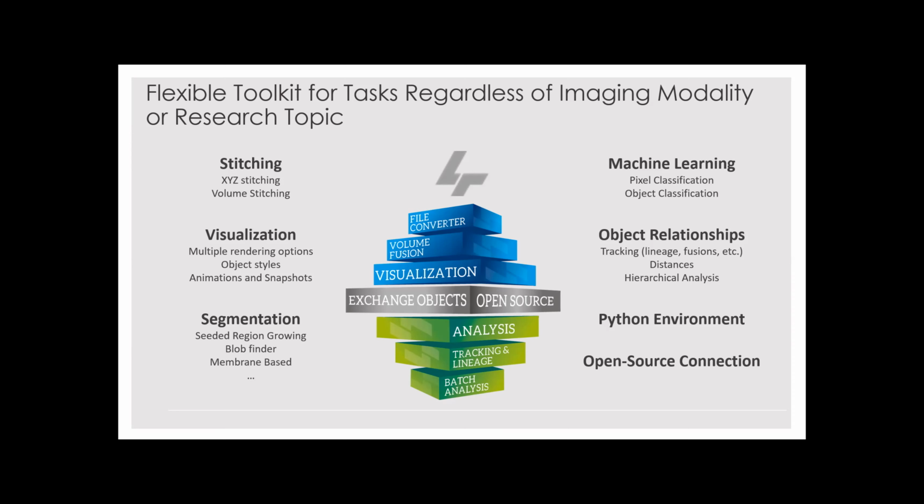As I said in the last slide, we also have a full Python script interface in Vision 4D itself. So you do not have to leave the environment to leverage this for your needs in case any of our traditional methods do not work for your research question at hand. We also have a connection in Vision 4D to open source so that you can bring things in and take things out if you really need to in a hopefully painless way.